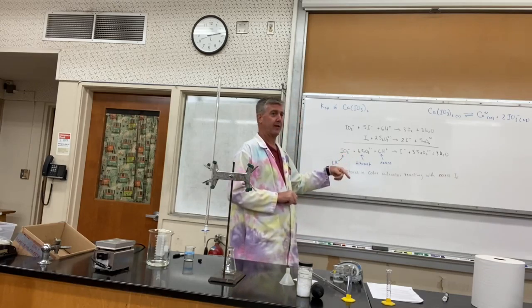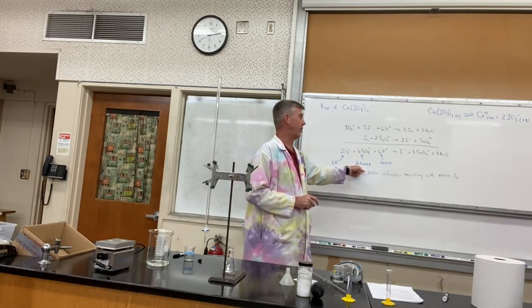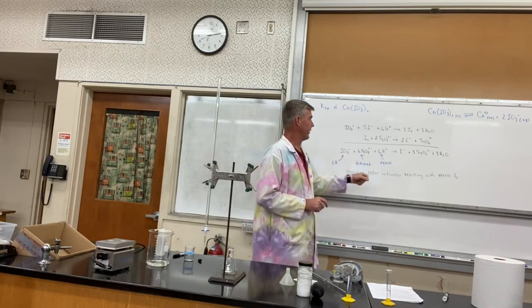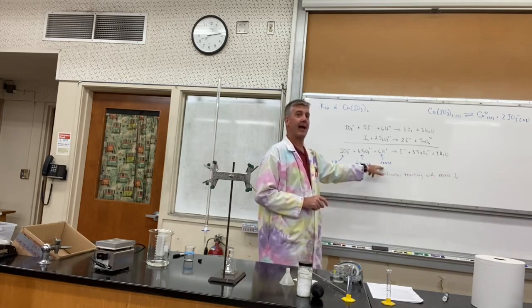We're going to put it in our burette holder, and then we're going to read the bottom of our meniscus and get our initial burette volume. So there's our thiosulfate.